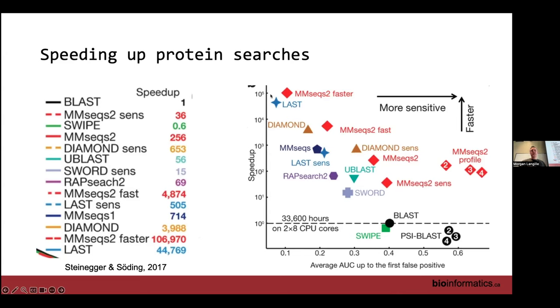Anyway, I explained a couple of approaches here. Carnelian actually uses a k-mer-based approach, and it actually calls genes first. In most of these cases, people aren't calling genes. There are no gene callers; they're just using BLASTx, which is a six-frame translation of the nucleotide sequence into all possible proteins. HUMAnN 3 we're going to talk about a little more. It's very popular and fairly fast. It can be used for more than just humans, but it may not cover everything. And as we'll see, it basically does the UniRef to MetaCyc pathway mapping.